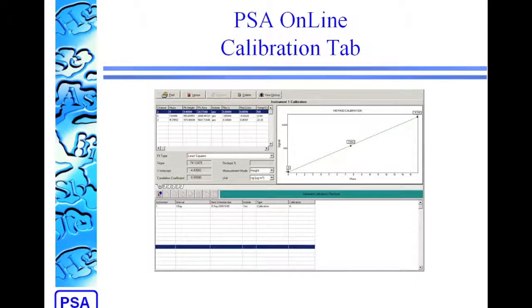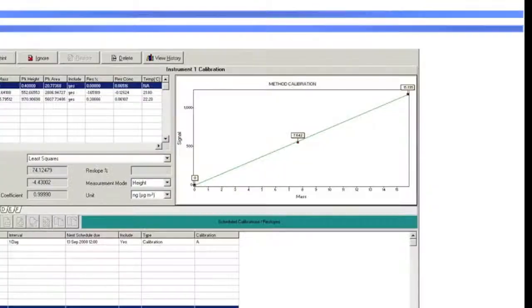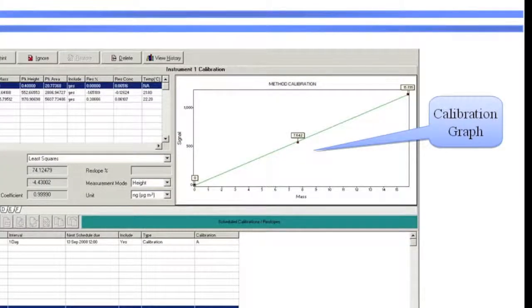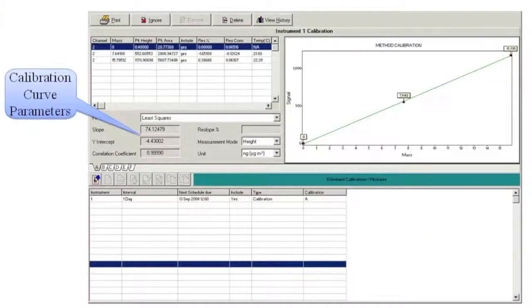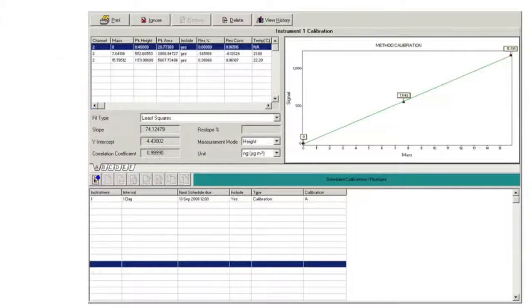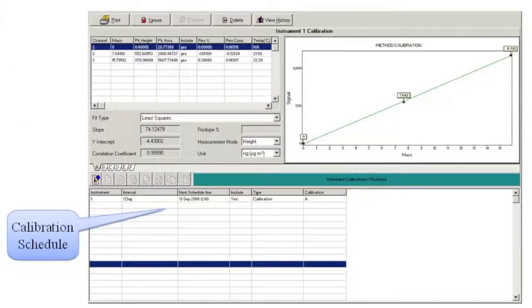The calibration tab shows the analyzer calibration. It's typically one or two calibrations, but there could be up to six concurrent calibrations running, depending on the system configuration. To the right of the page, we have the calibration graph for the currently showing calibration, and that's a signal versus mass graph. To the left of the page, there's the details for the points on the graph, and the figures of merit for that calibration curve. And at the bottom of that display, we can set up how often we want the analyzer to calibrate through the scheduling interface.